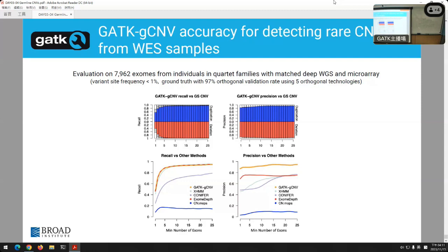So for example, if I have a read that maps to multiple locations of the genome, should I remove it from the analysis or should I keep it? You don't have to remove it from your BAM file before starting GCNV, but you will want to provide those annotations of where those regions occur in the reference genome so that the filter intervals step can remove them if it doesn't think it's going to be able to do a good job.